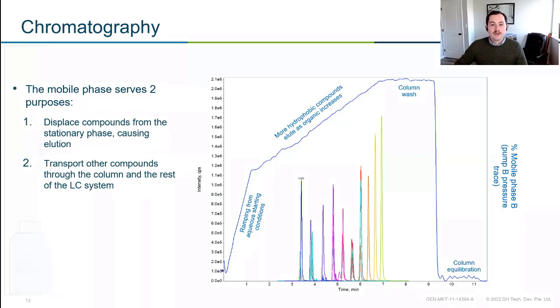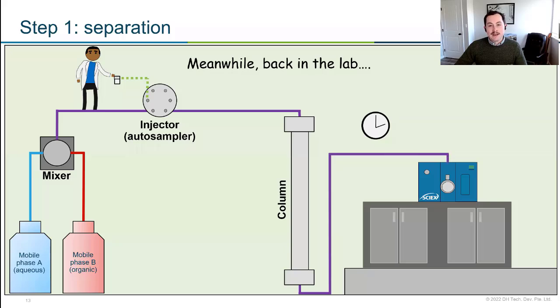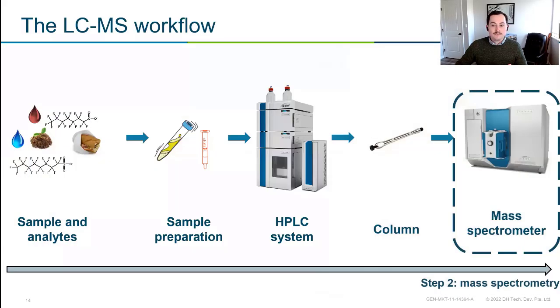So if we go back into the lab, we talked about our chromatography, we've injected our sample, it's gone through a column, we have separation, it's made its way to a mass spec, and now we get to do our mass spec analysis. Everything up until this point has just been us introducing the sample to our mass spec. Now we get to use the mass spec selectivity to actually quantify and use the data.